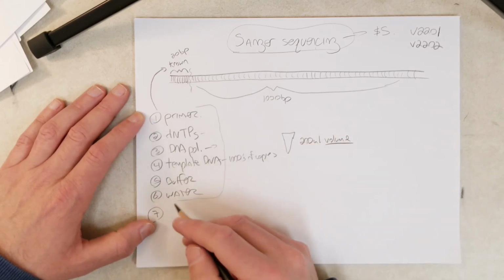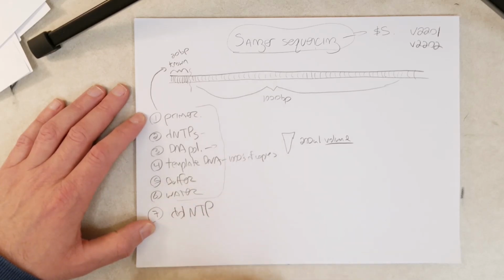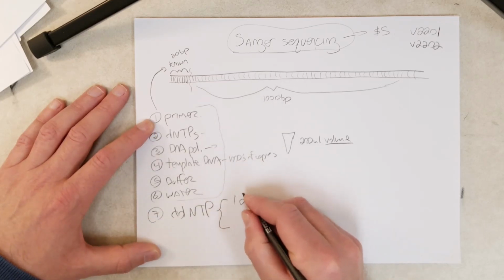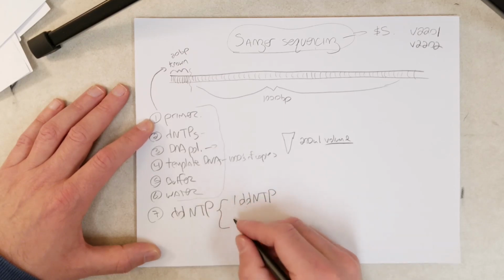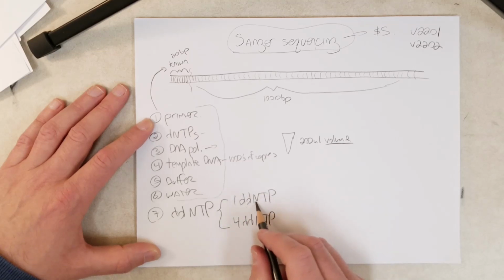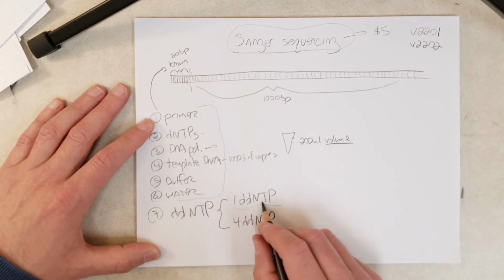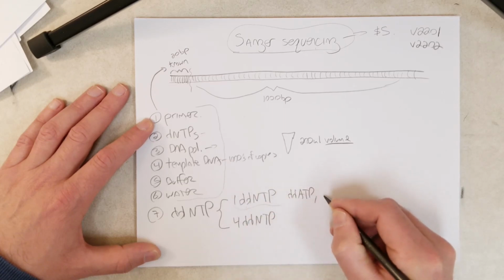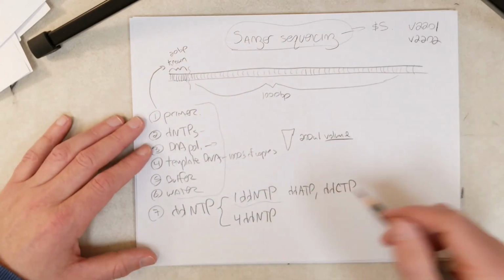Now, the 7th component we are going to need is ddNTPs. Specifically, in the classical version, we need 1 ddNTP. I'm going to talk about this in a second. In the new version, we can use all 4. NTP stands for A, C, G, or T. So with the classical version, we're going to need to perform 4 separate reactions: 1 reaction with ddATP, 1 reaction with ddCTP, and so on and so forth. You'll see why in a moment.